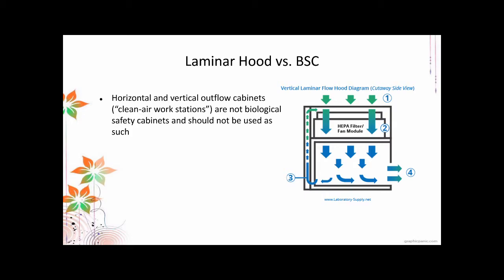They are not BSCs because, as you can see, they filter the incoming air and direct the clean air to the product, because this is the work area. The air from the work area can go outside without any filter. So rather than protecting the environment, the purpose of the laminar hood is to protect your product, because the air from the work area simply goes out to the environment.